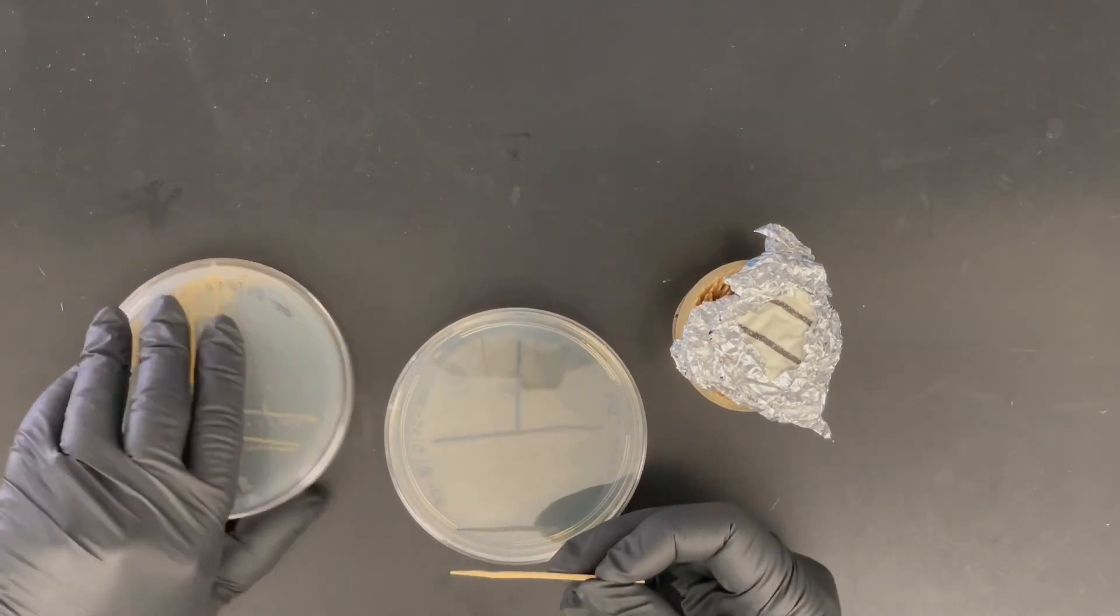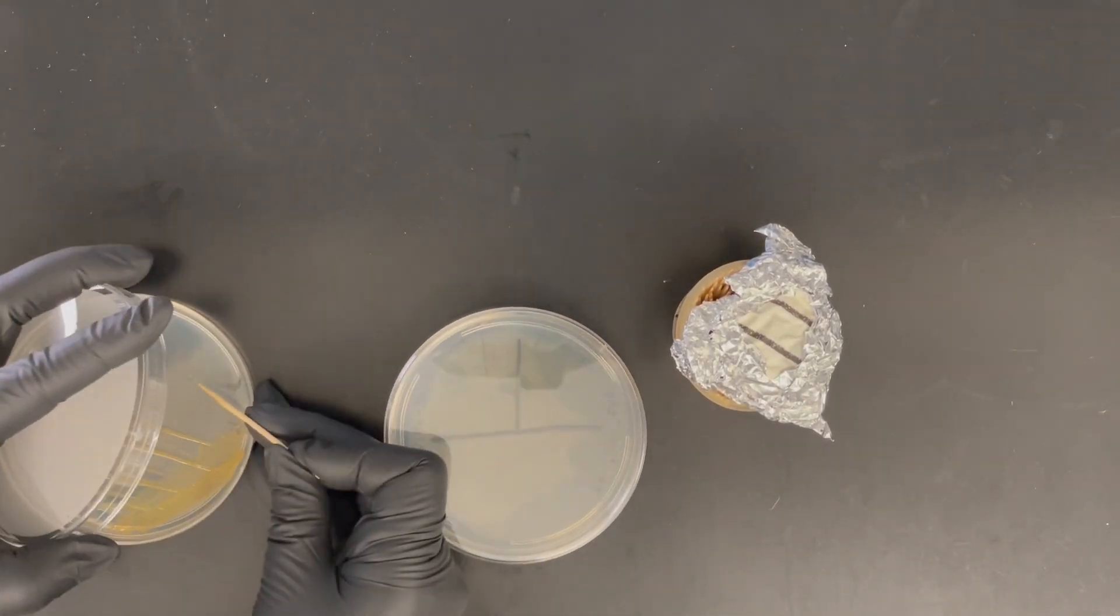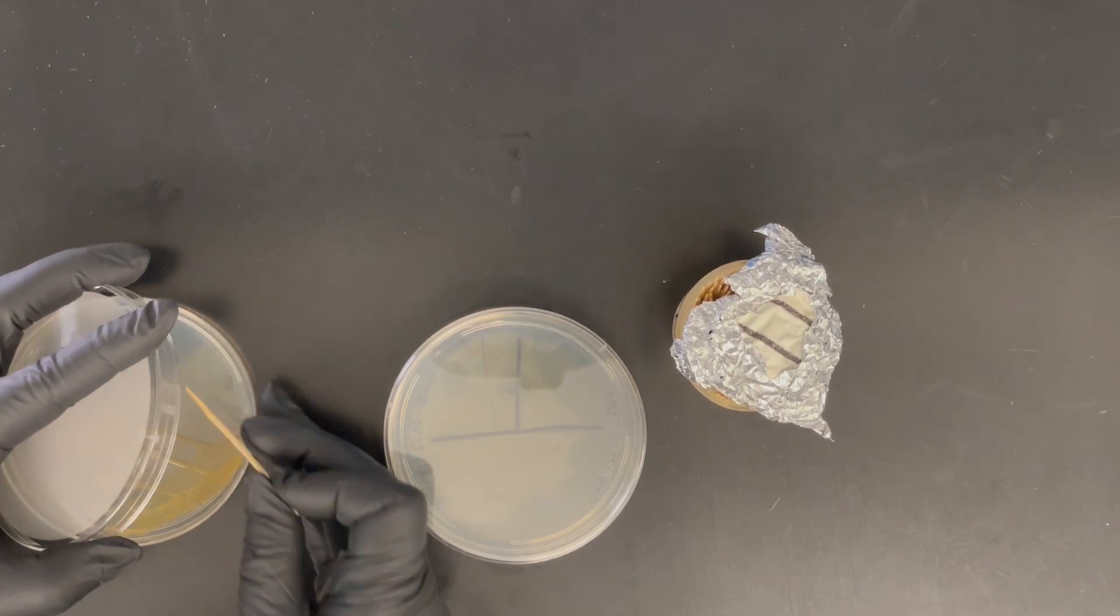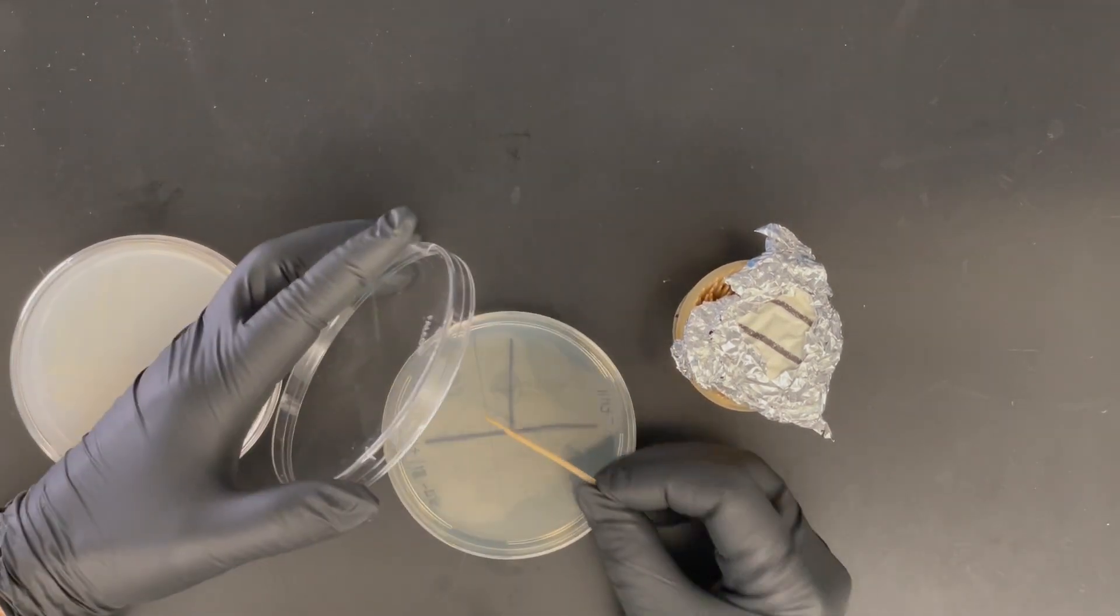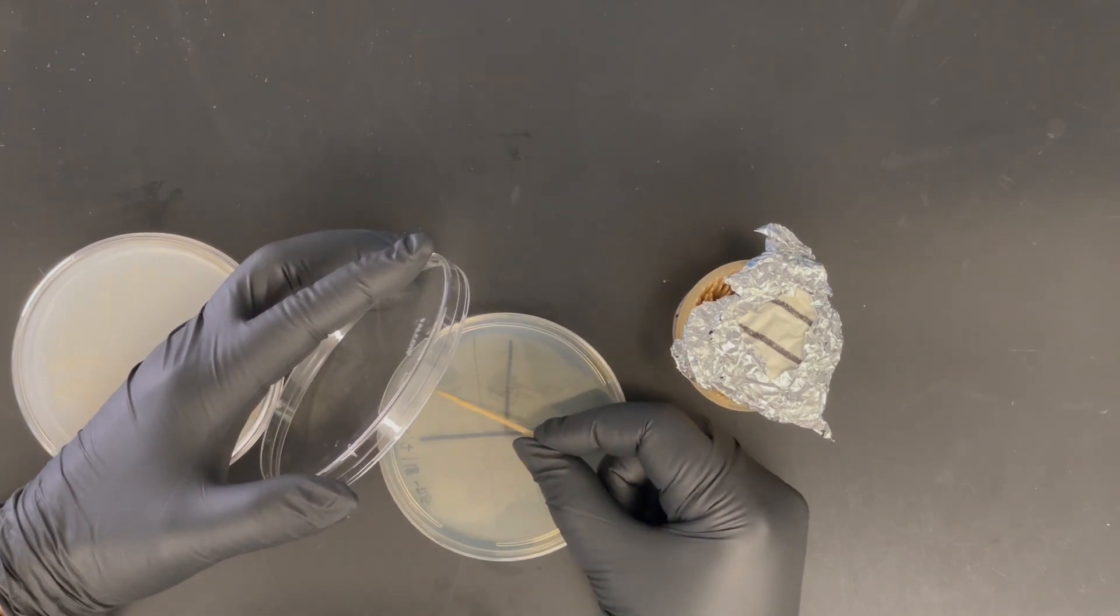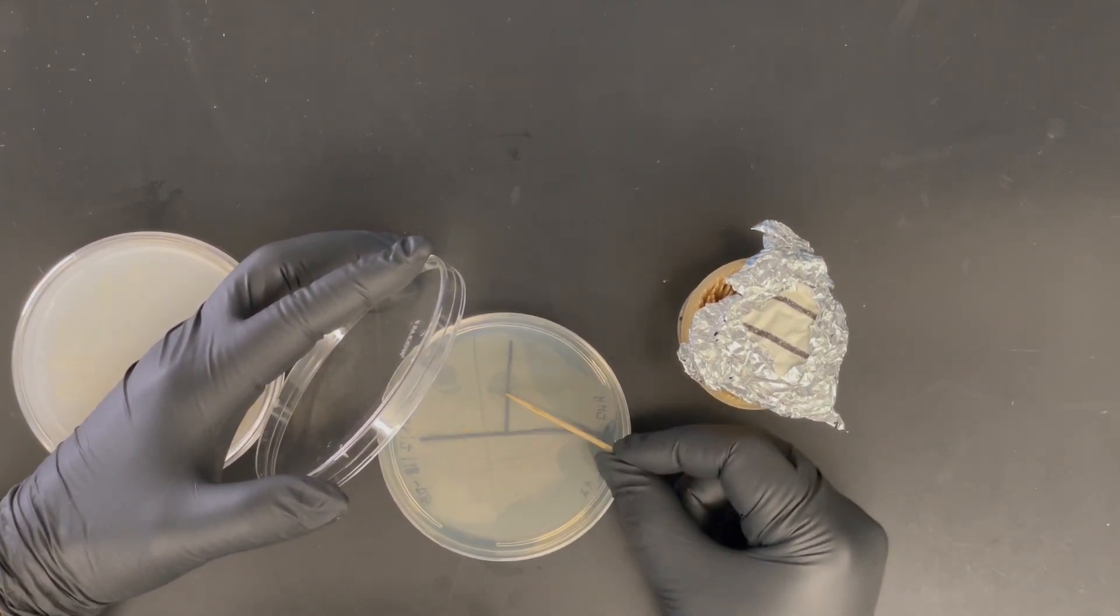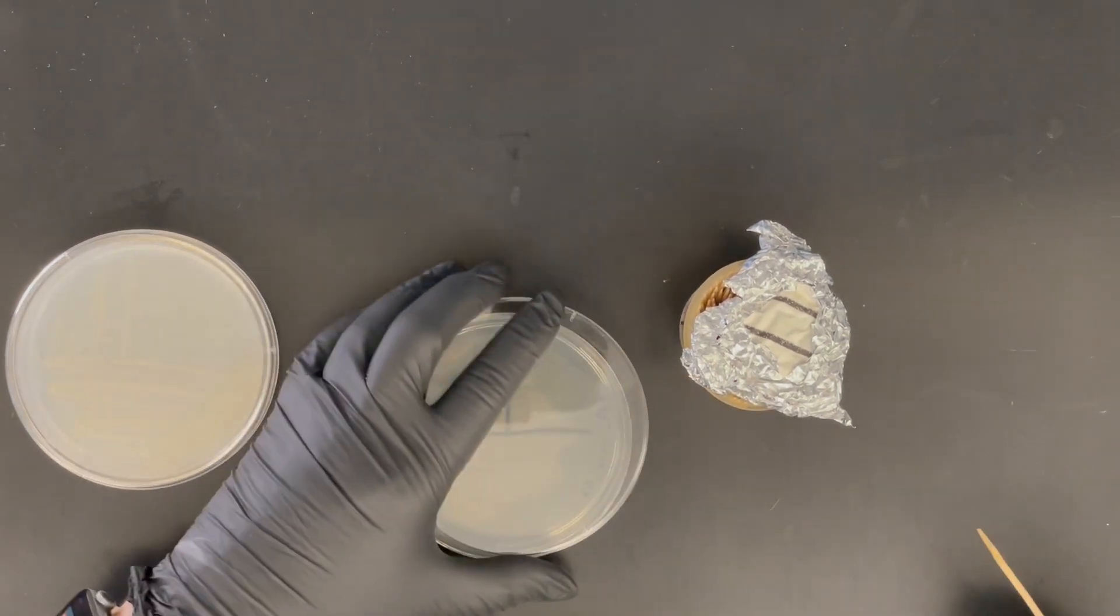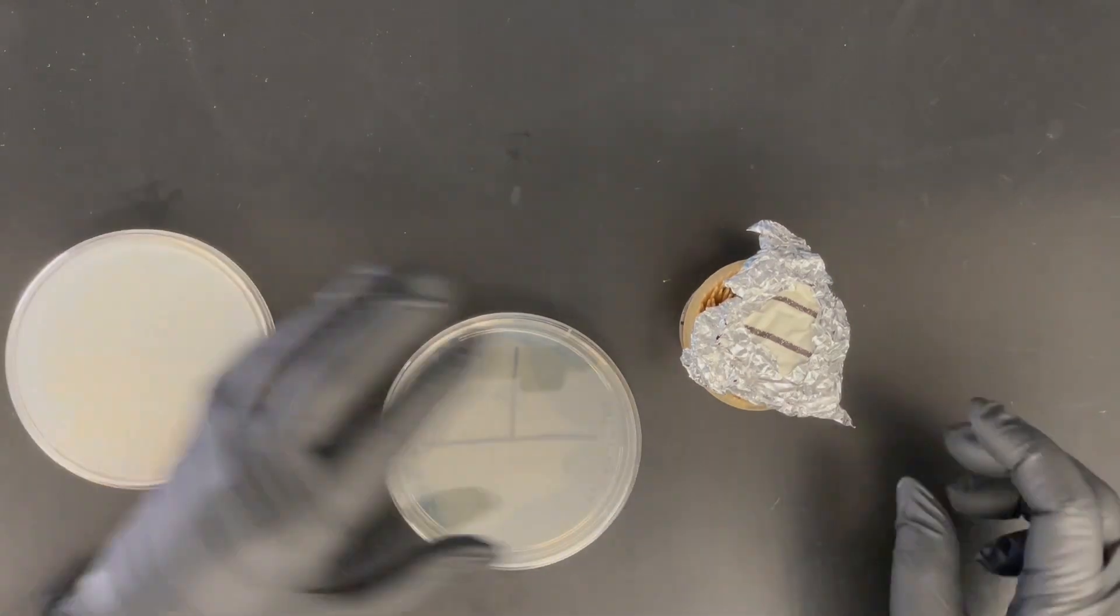I'm going to pick the colony that I'm choosing off of the first streak. I'm just going to dab in there. You don't have to go crazy. And then you're going to go back and forth. I find that the toothpicks kind of gouge the agar and it's not as nice as using the inoculating loop. But what is nice about the toothpicks is you can work faster.